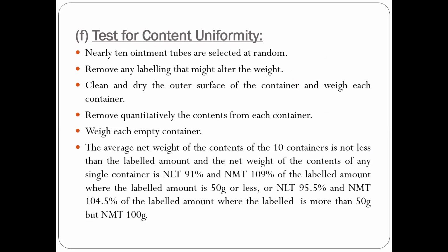And test for content uniformity. In this case, for the content uniformity, some 10 ointment tubes are selected at random. Then remove any labeling that might alter the weight also, any labels that are on the ointment tube.